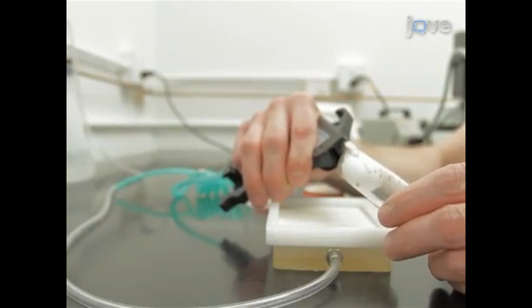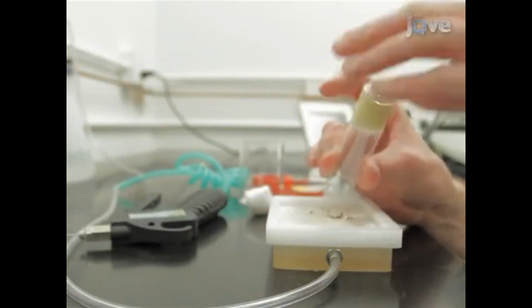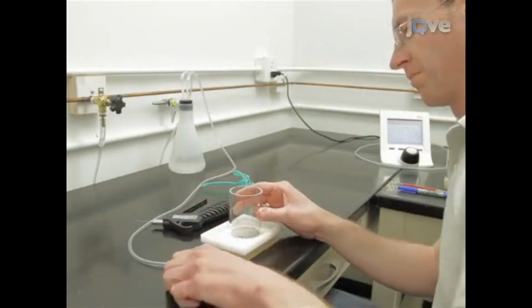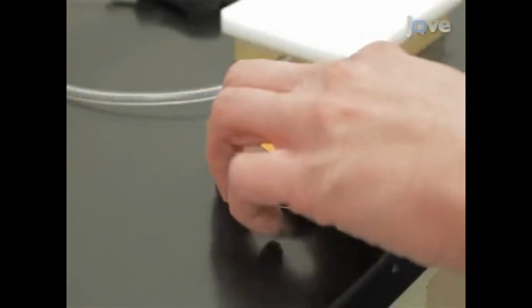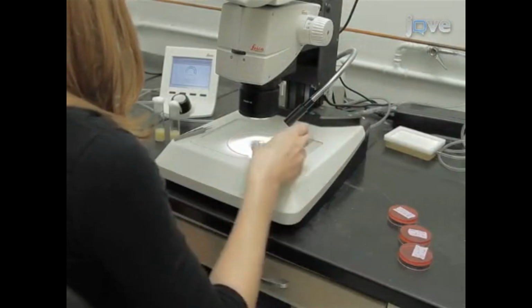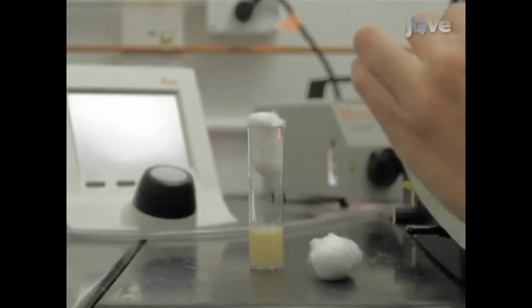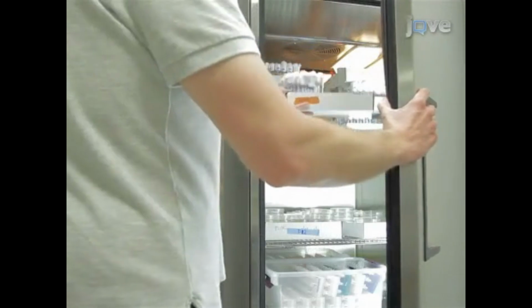Move a population of flies into a mating chamber, and then collect eggs every 24 hours for 3 days, ultimately creating 3 age cohorts. With the aid of a dissecting microscope, move batches of 50 eggs from each cohort into vials containing 10 milliliters of standard fly food. Incubate the vials at the desired temperature for larval development.